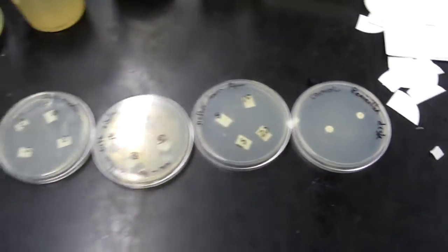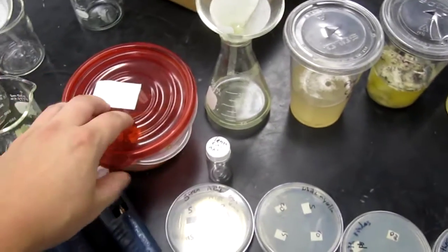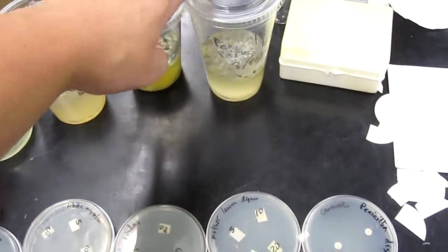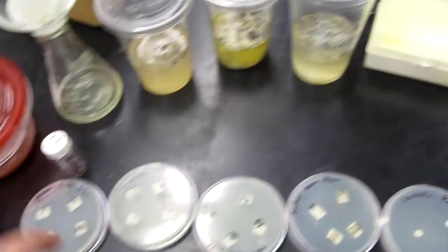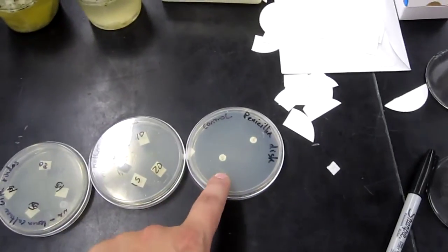The ultimate goal was to prove that you could isolate a penicillin strand from a lemon, liquid culture it, and then penicillin, the secondary metabolite, would be produced in the liquid broth and would show some form of inhibition against a gram-positive bacteria.